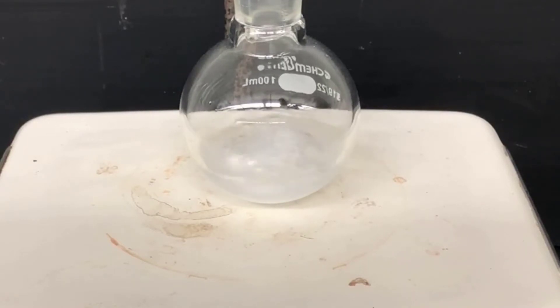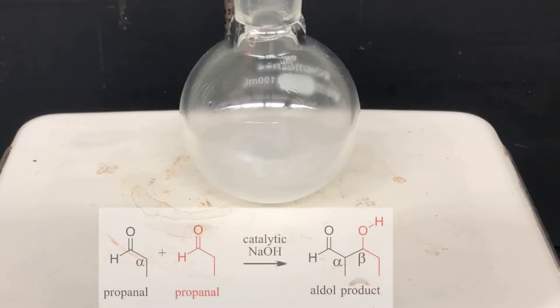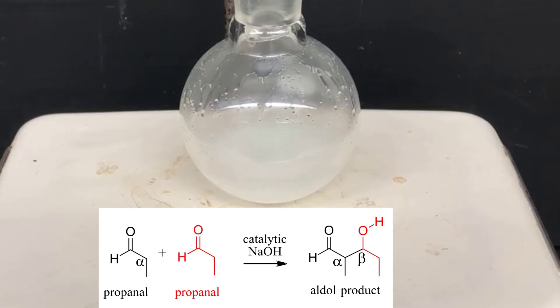The reaction generates the most heat in the early stages, then it'll gradually slow down and cool off. When it reaches room temperature again, we can be pretty confident that it's over. So continue to stir until the flask is about at room temperature. Here's the equation for the aldol reaction going on in the flask: two molecules of propanal are condensing to form an aldol product. The alpha position of one propanal attacks the carbonyl carbon of another propanal molecule to make a new carbon-carbon bond in the product between the alpha and beta positions.